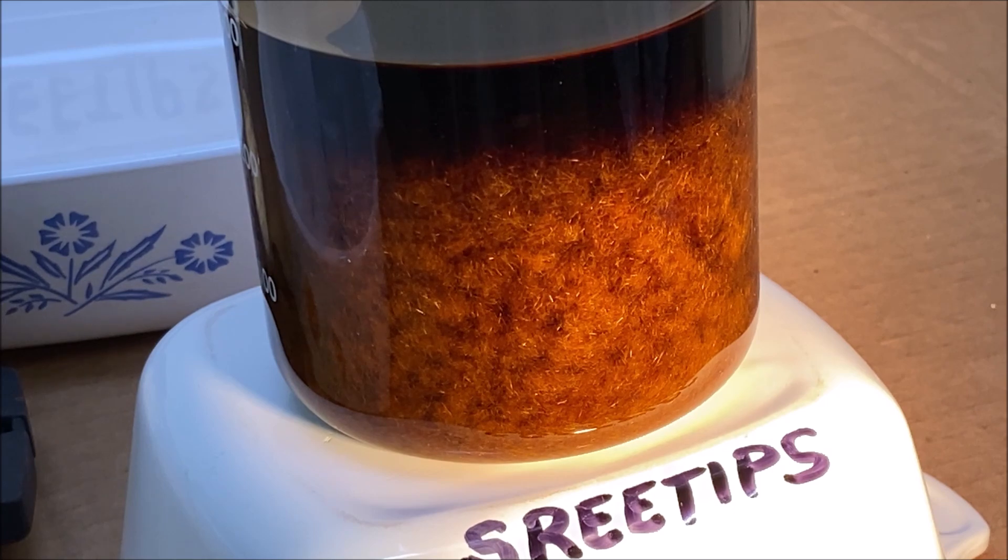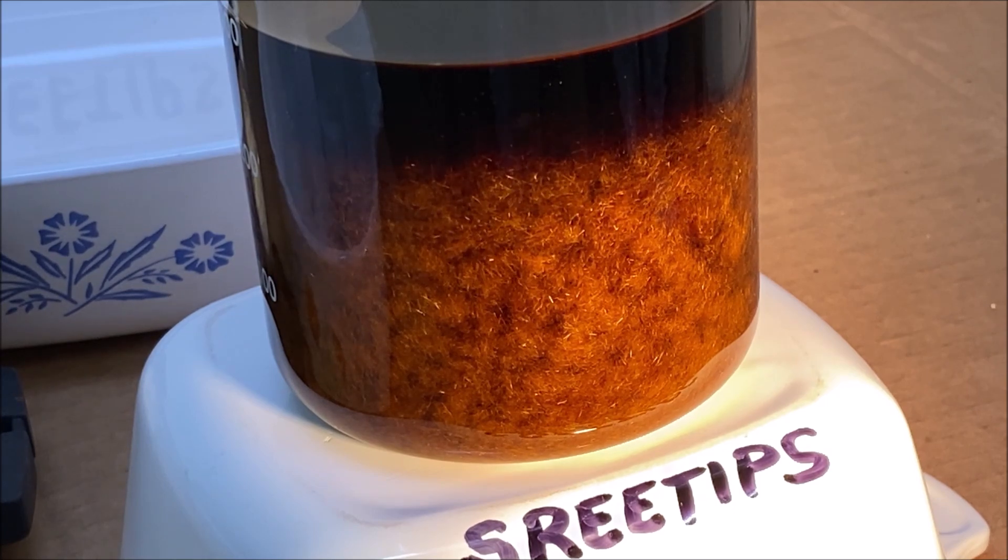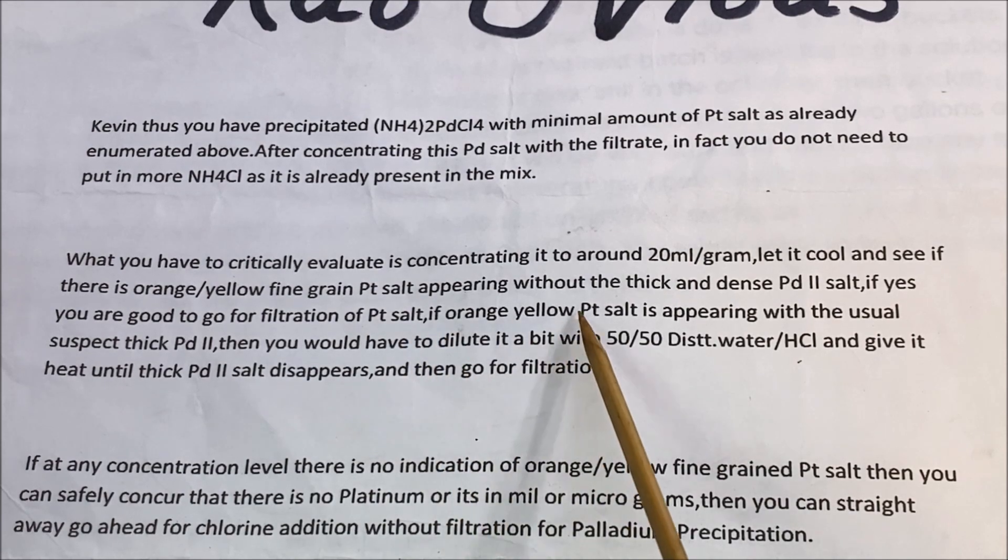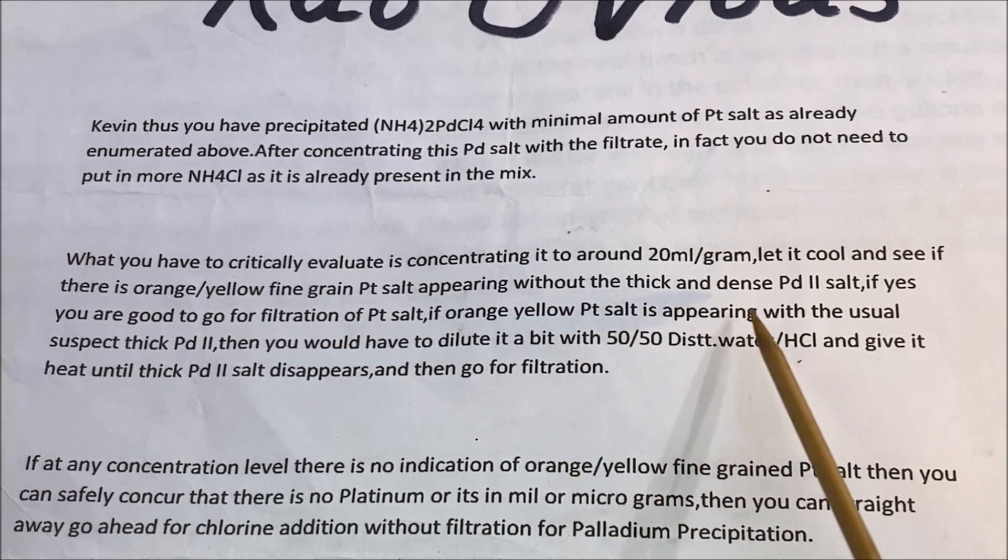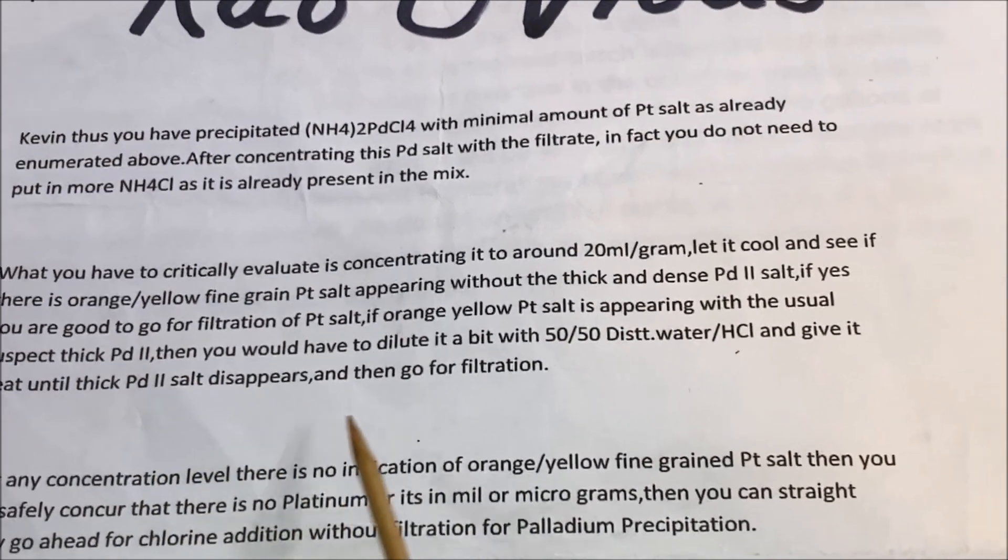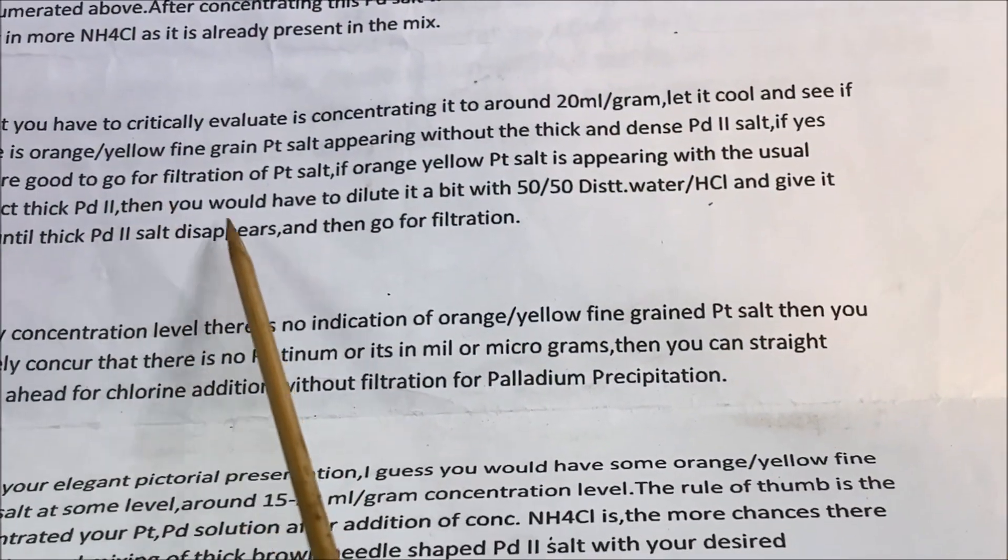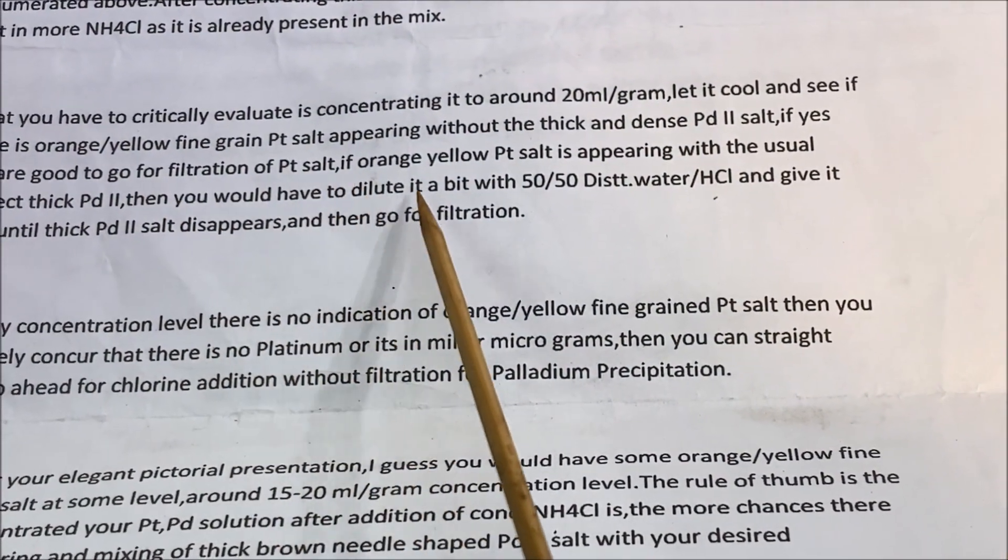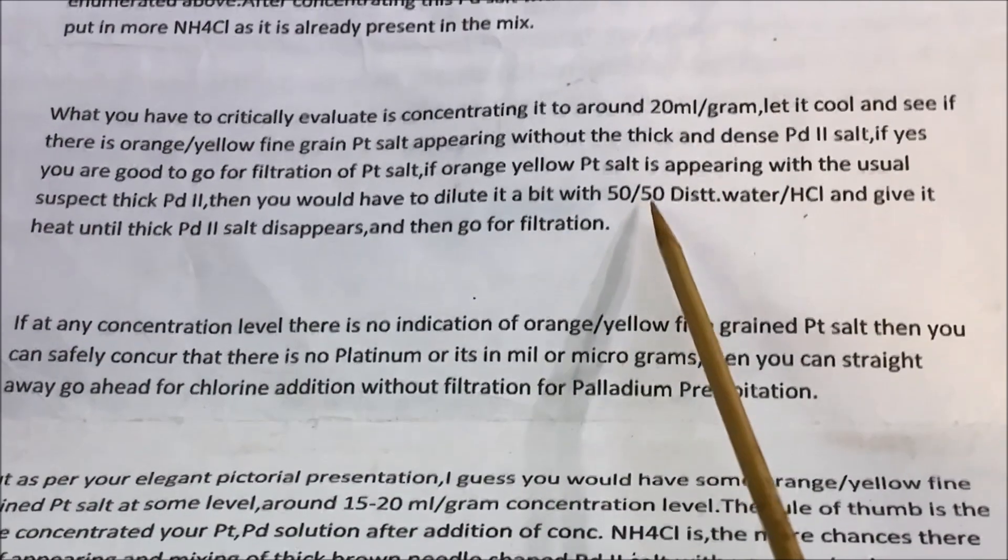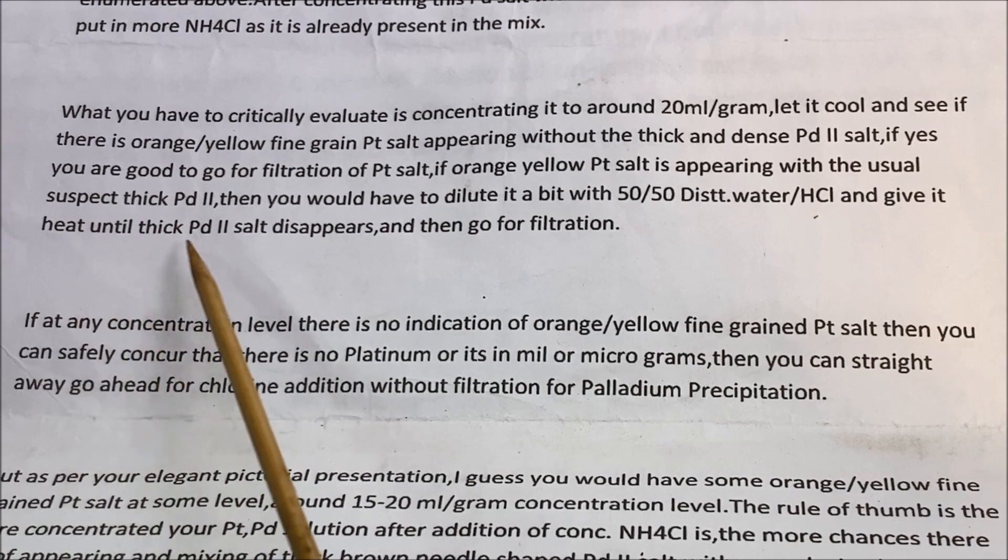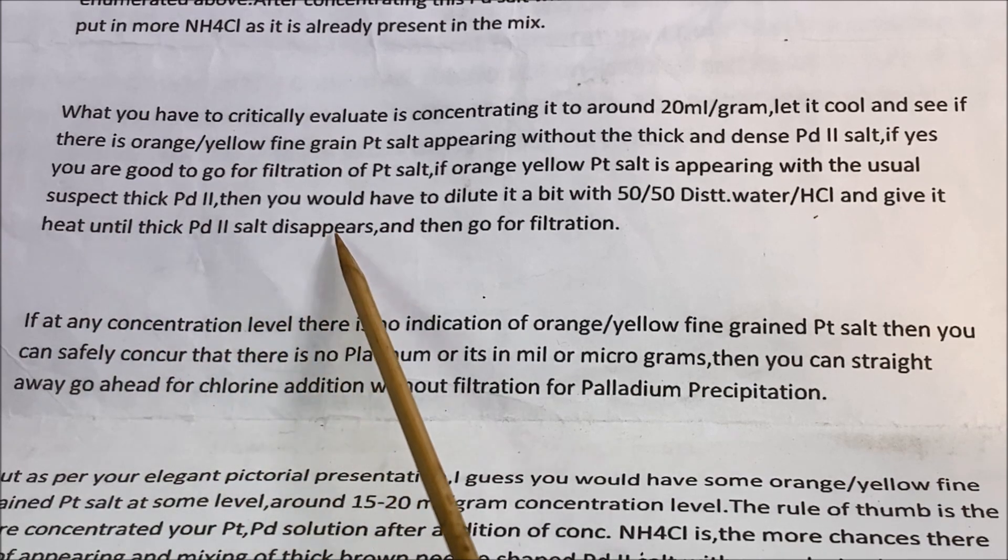This is the condition I think I have. If the orange yellow Pt salt is appearing with the usual suspect thick PdCl2, which is I think what that is right there, thick needle-like crystals, then you have to dilute it a bit with some 50-50 distilled water and hydrochloric acid and give it a little heat until the thick PdCl2 salt disappears.